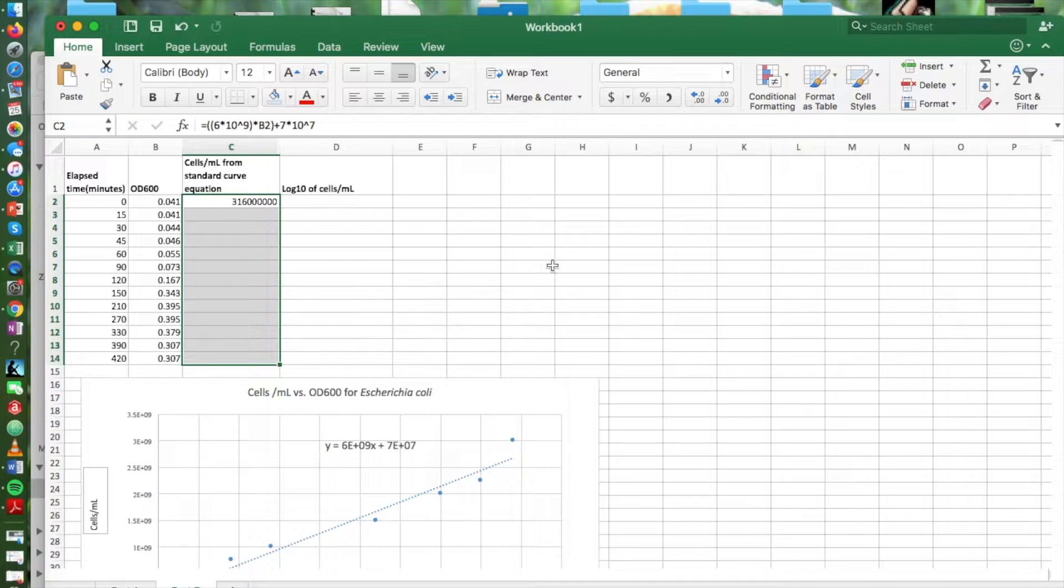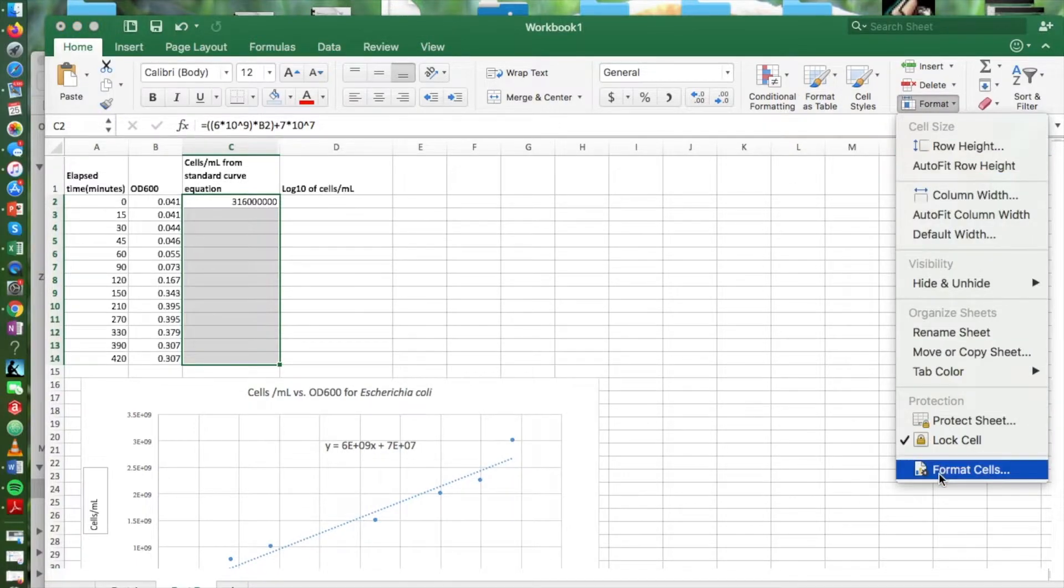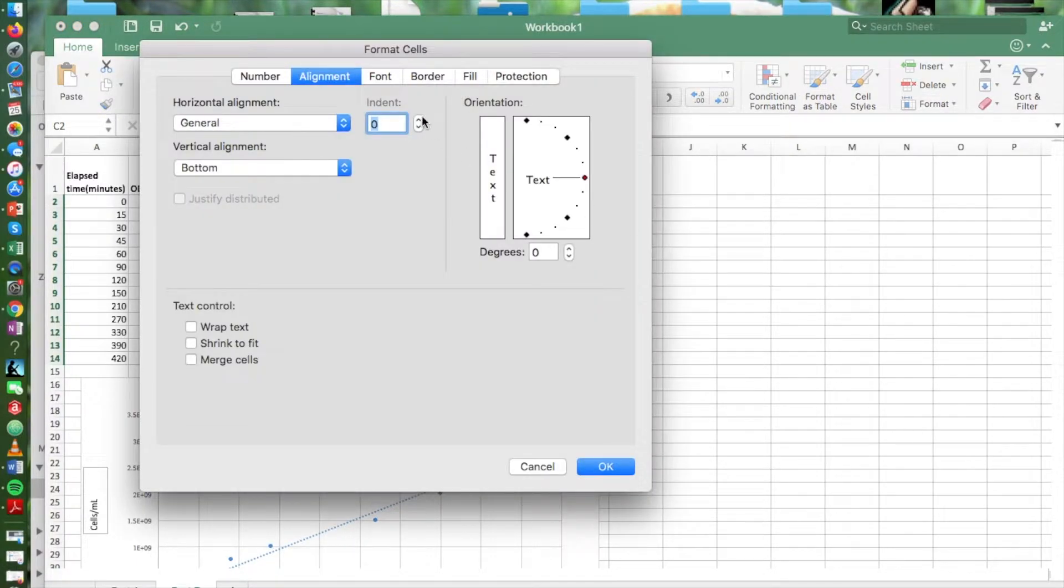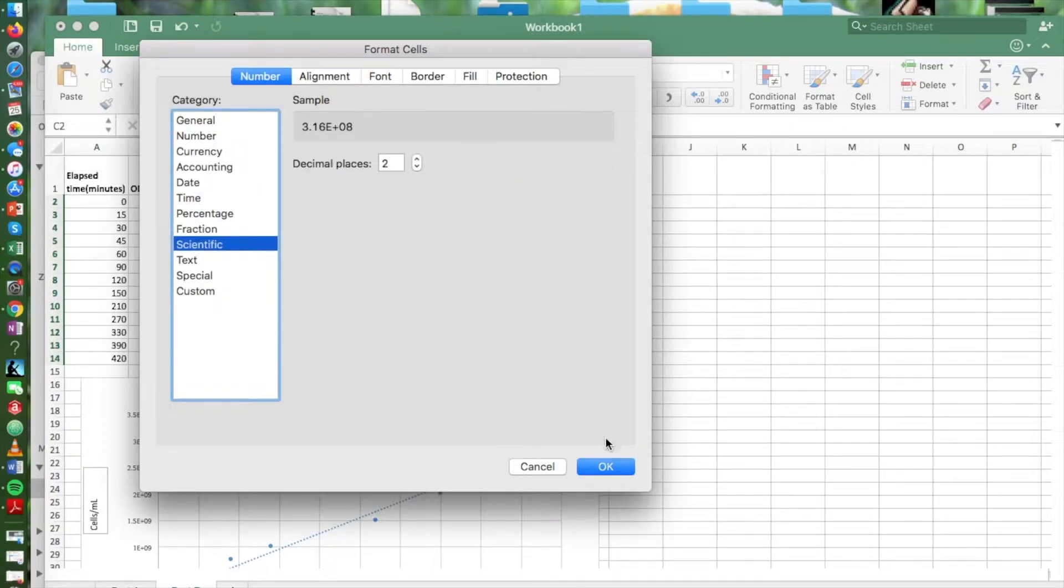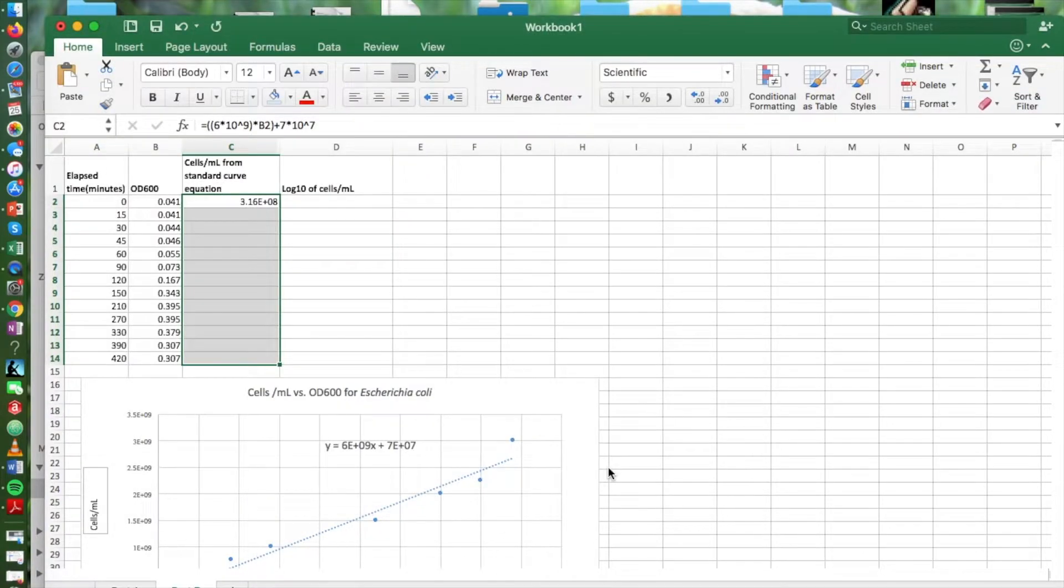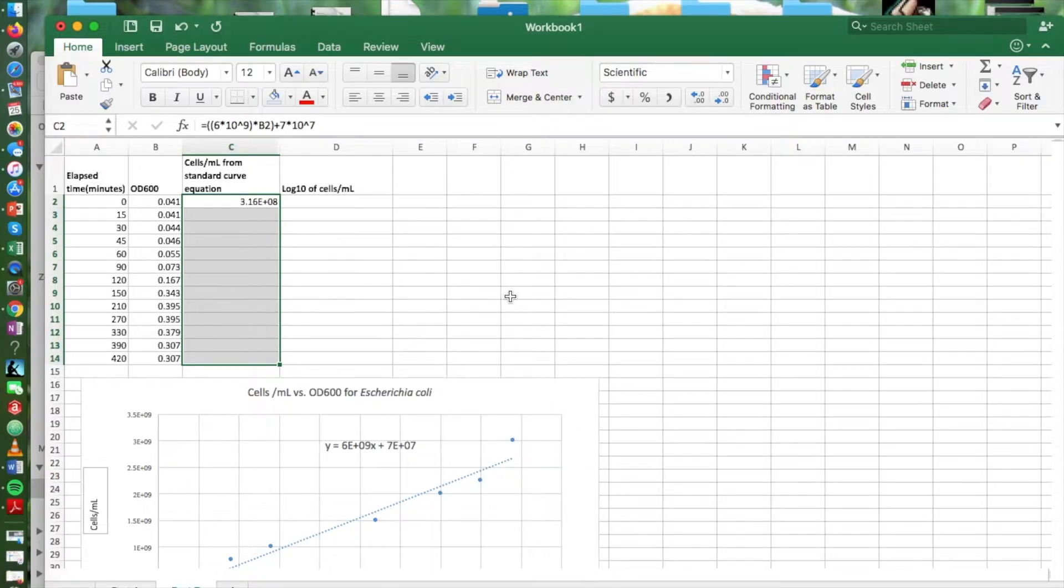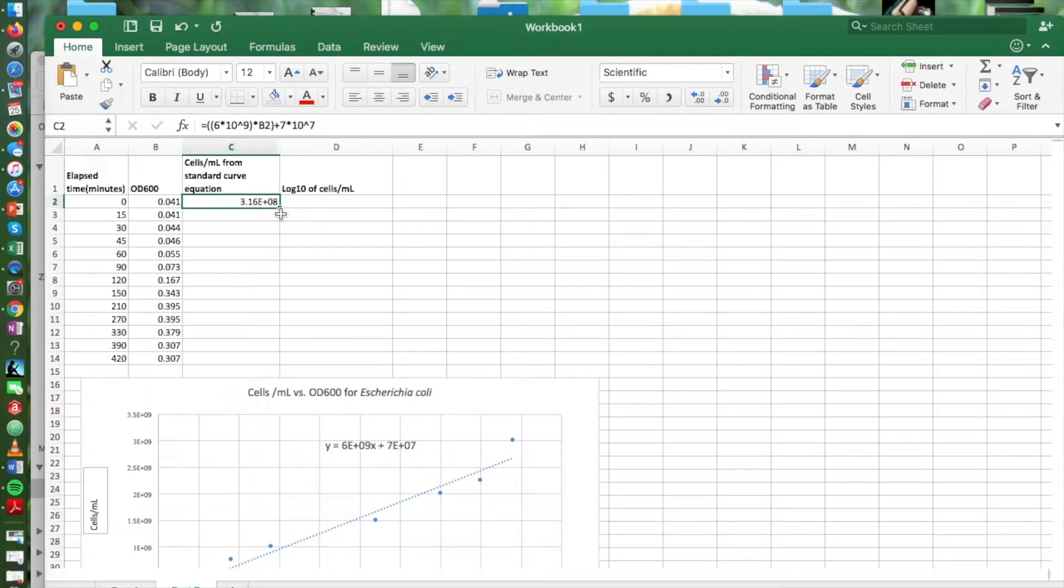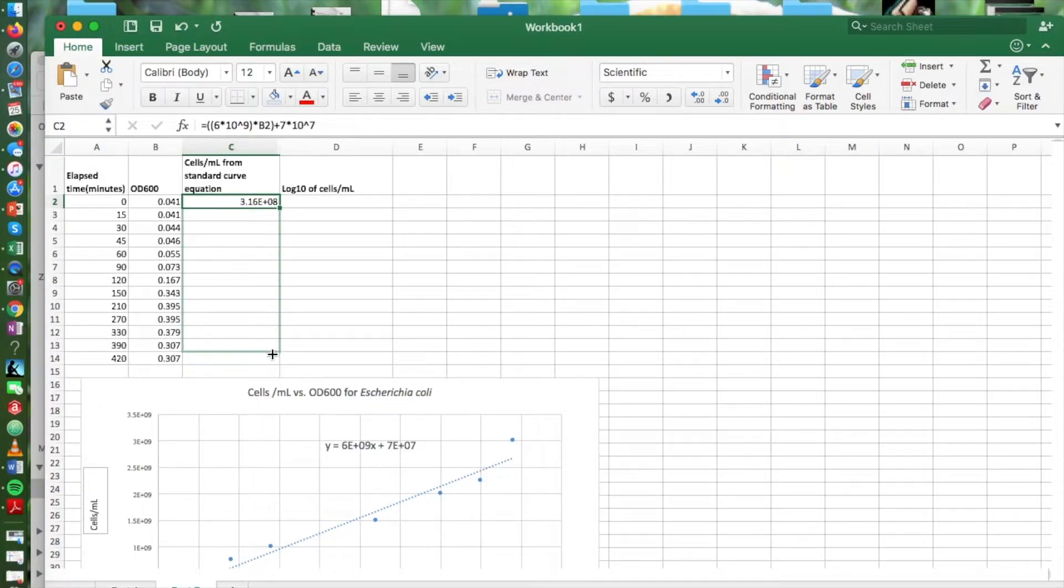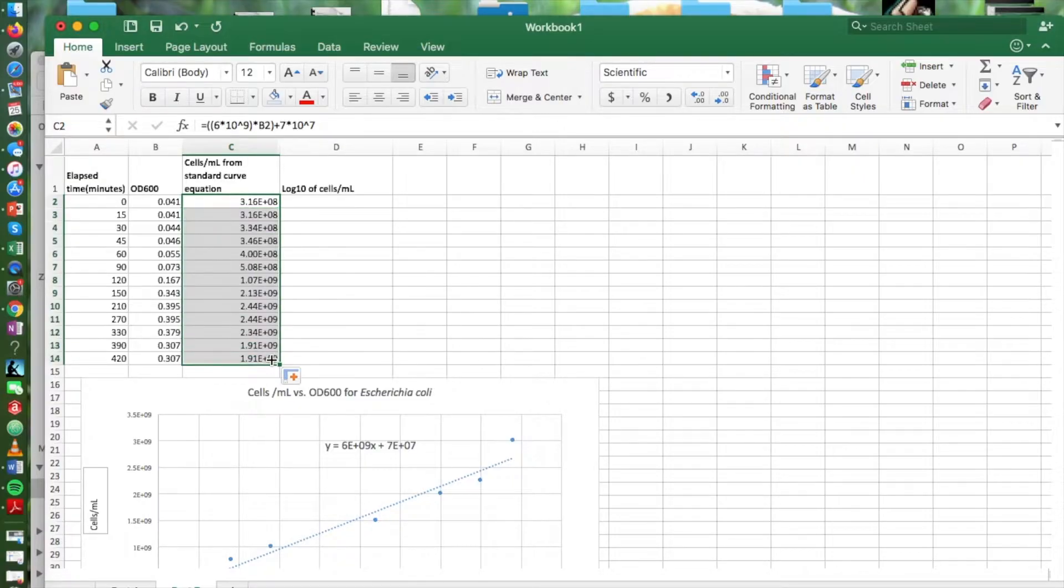We're going to pull that formula down after we convert this to the OD reading. We'll put our calculation here in scientific notation. And then we pull our formula down and there are all of our calculations.